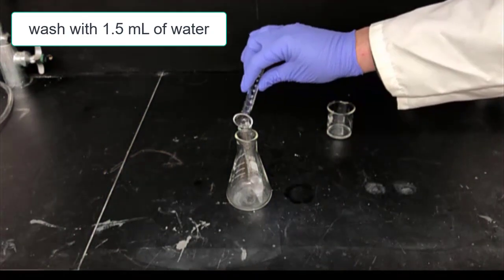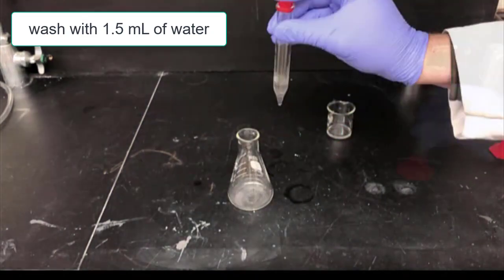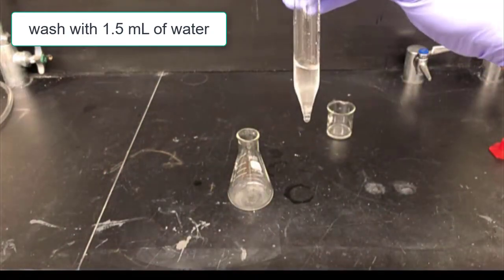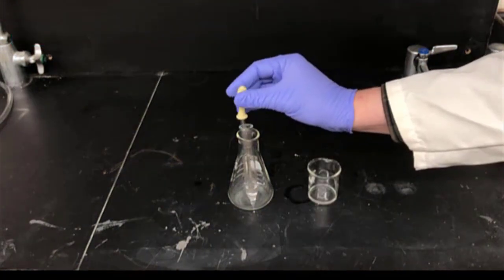Next, we'll add 1.5 milliliters of water to the centrifuge tube, agitate it, allow the layers to separate, and then remove the lower layer and discard it.